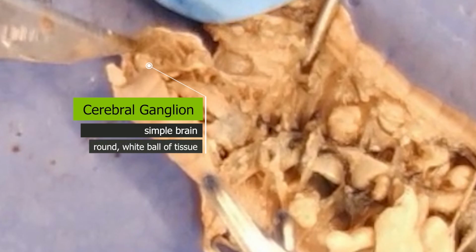Maybe some of this, see that little patch there? That might be part of it there towards the end of the earthworm. Okay. See a little patch? Yeah.